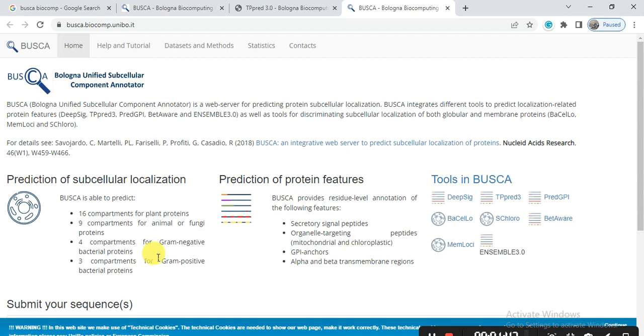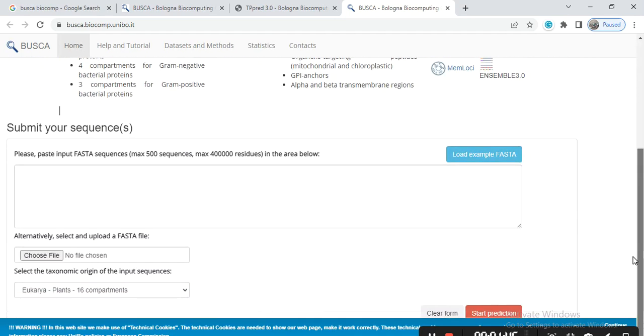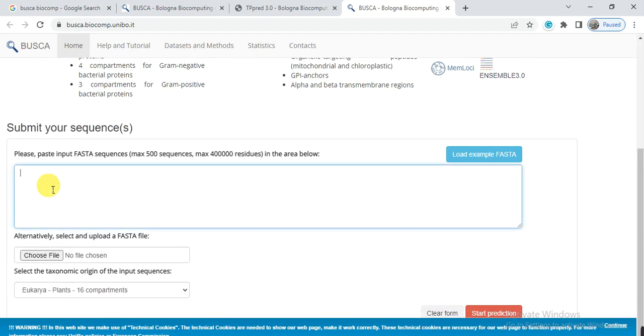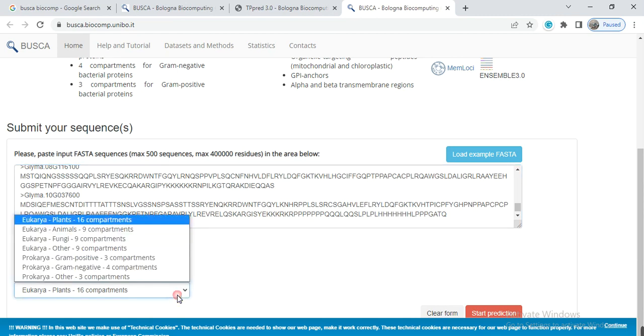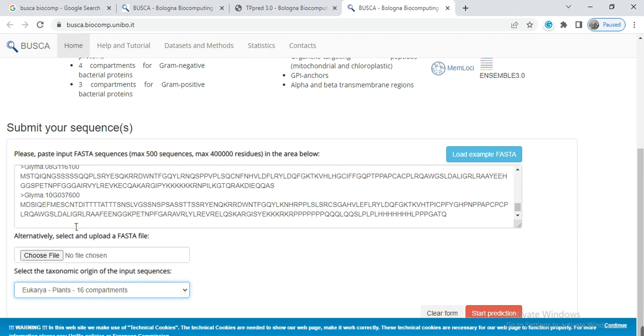And it gives some information about this website. So simply you paste your sequences in this box, and from here you can select that these sequences are from plant, animal, fungi, from where. My sequences are from plant, so I select the plant, and then click here Start Prediction.